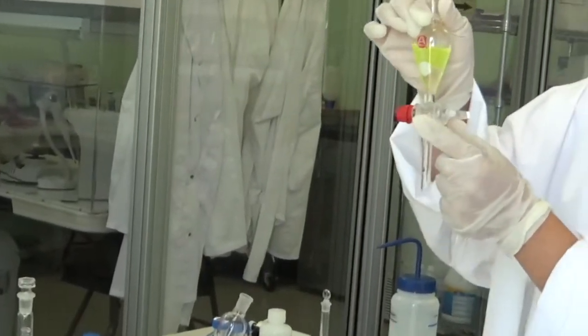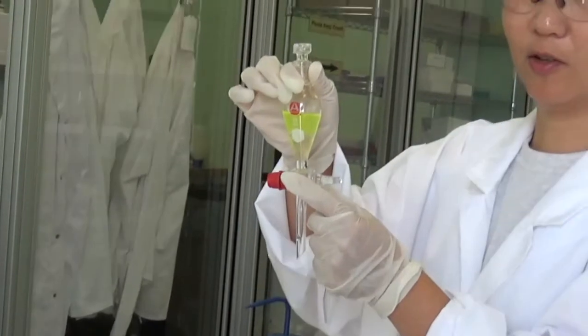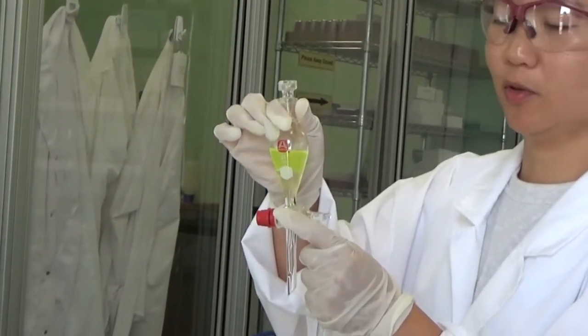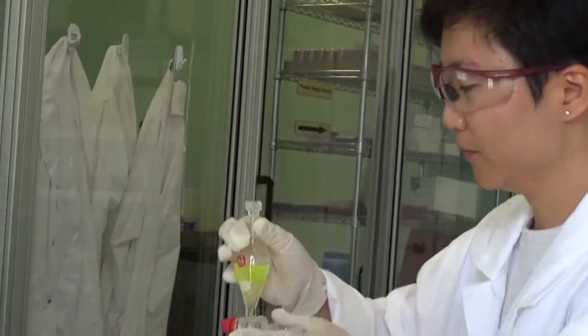However, we also have a tiny bit of aqueous solution stuck at the bottom, so we need to get rid of it first.